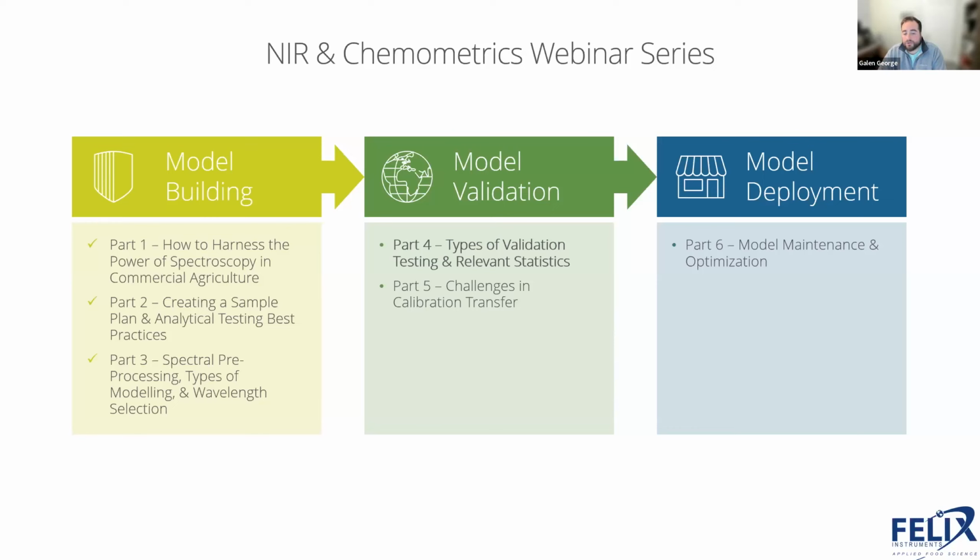And then we'll go into a little bit about the challenges in calibration transfer. And then our last part of the series will be about how to maintain your model and optimize it after you've deployed it. And then that'll be the end of our chemometrics series.